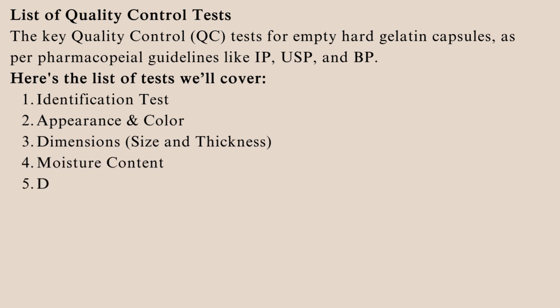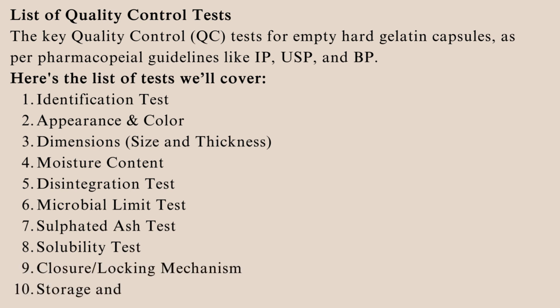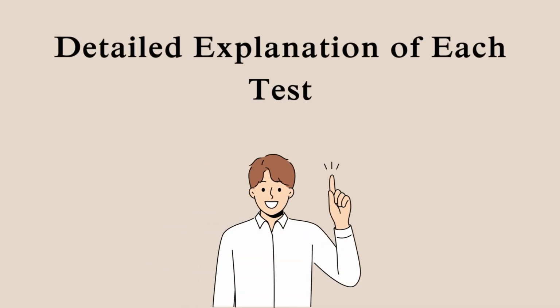6. Microbial limit test. 7. Sulphated ash test. 8. Solubility test. 9. Closure/locking mechanism. 10. Storage and packaging condition check. Detailed explanation of each test.